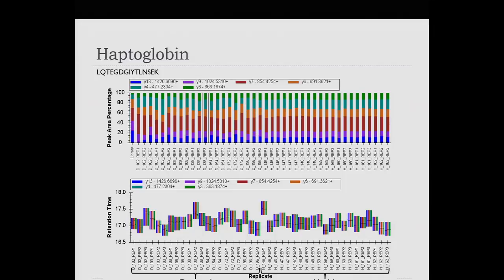So if we had IRTs in this run and we aligned by IRTs, a lot of this variance would even just go away. But we can get used to this level of variance and expect it from run to run. We're talking about a minute. Very little is much further than a minute away from any other run. So that's very, very good consistency.